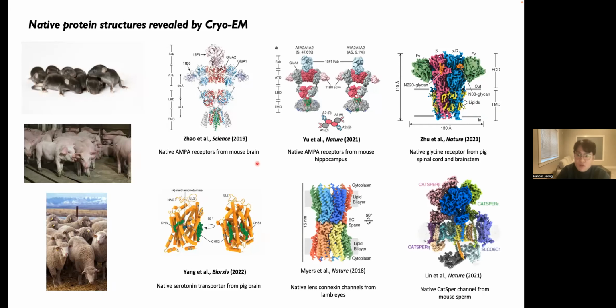post-translational modifications, and the lipid molecules, which help to stabilize protein structure. Also, the development of cryo-electron microscopy enabled us to analyze protein structure with a very small number of proteins. However, in order to isolate native proteins, we need strong antibodies to pull down the target protein from an animal source. But we don't have such strong antibodies for isolating TMC1 proteins or each component protein.